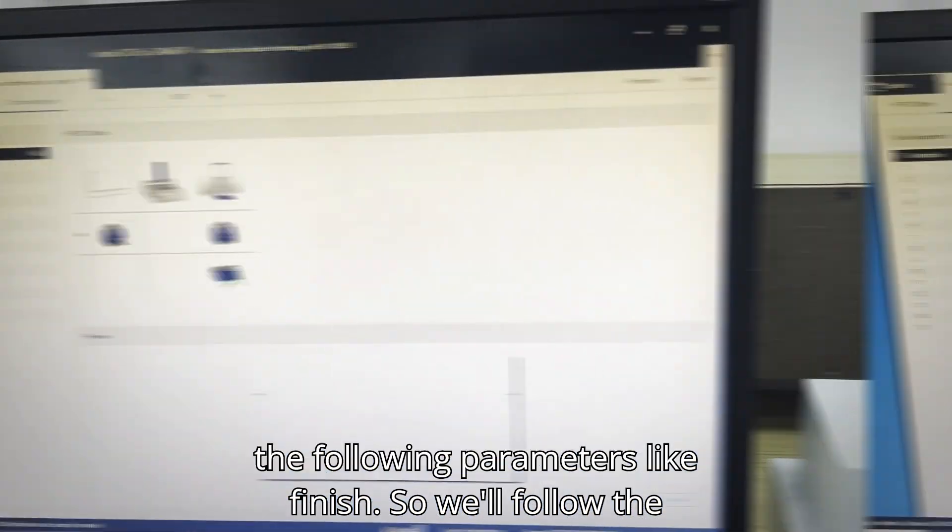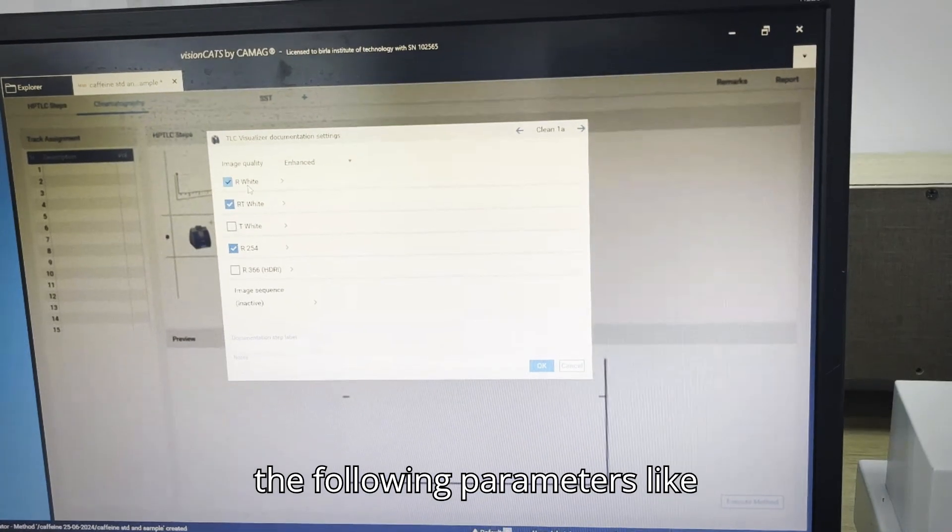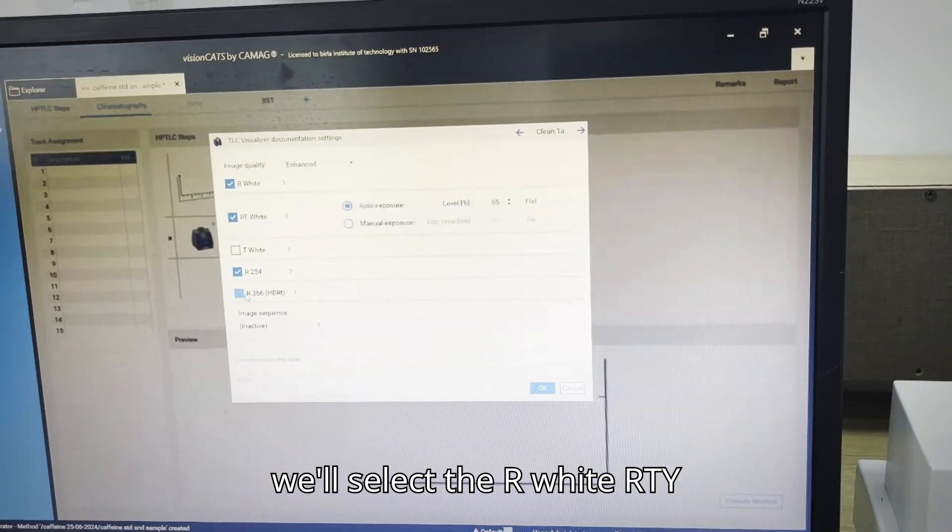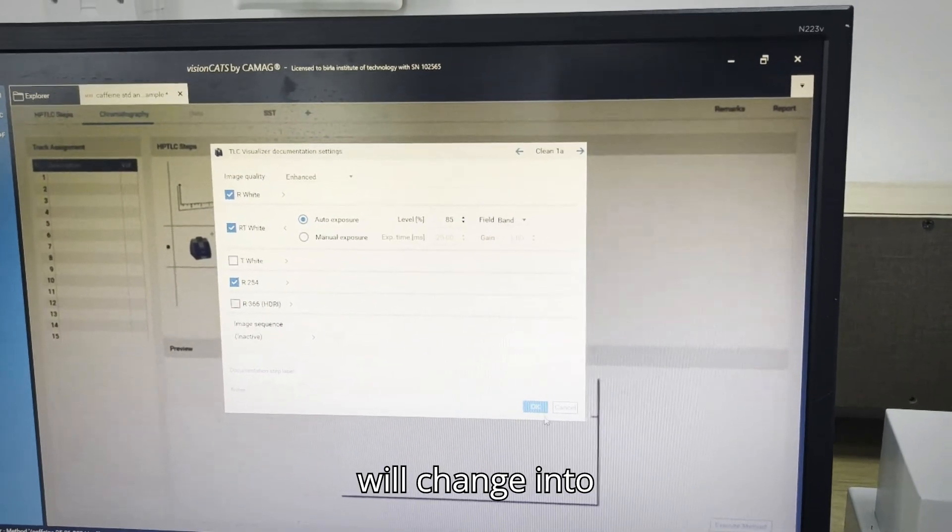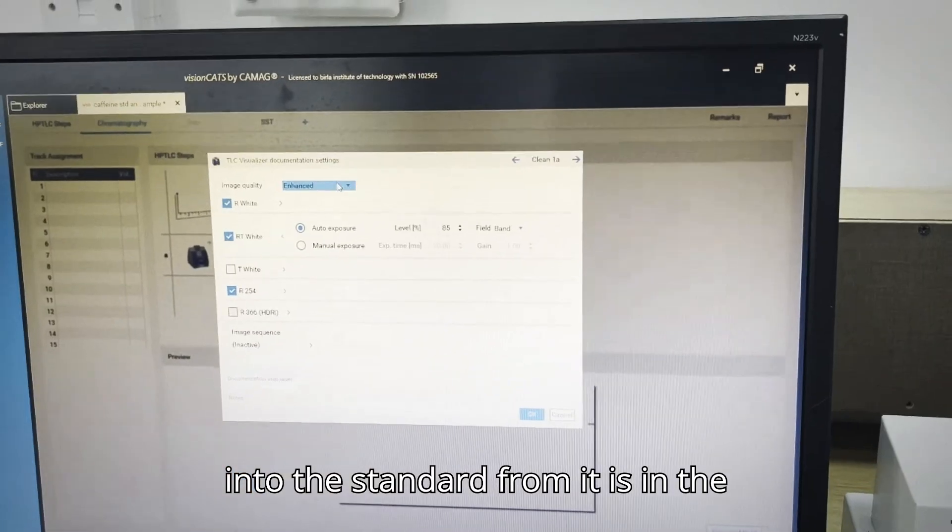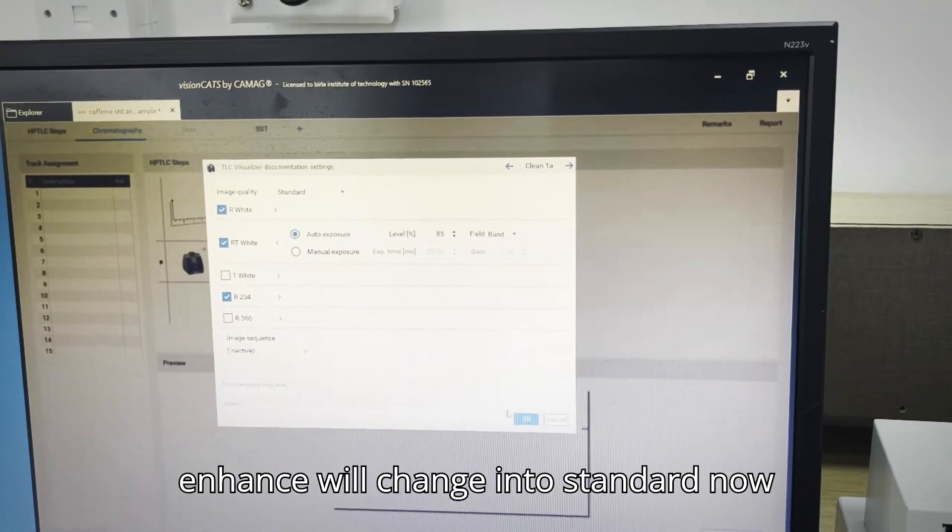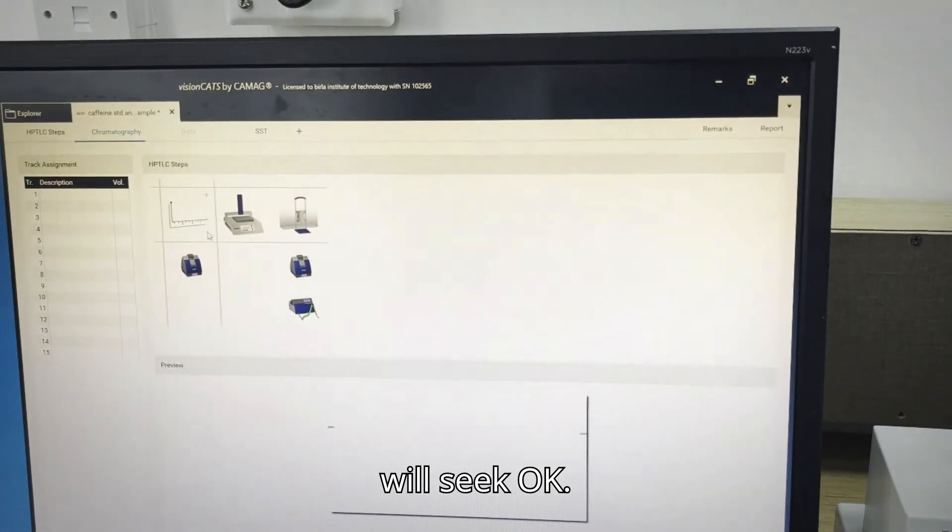We will follow the following parameters like we will select the R White, RT White, R254. Then we will change into the standard from enhanced, we will change into standard. Now we will click OK.